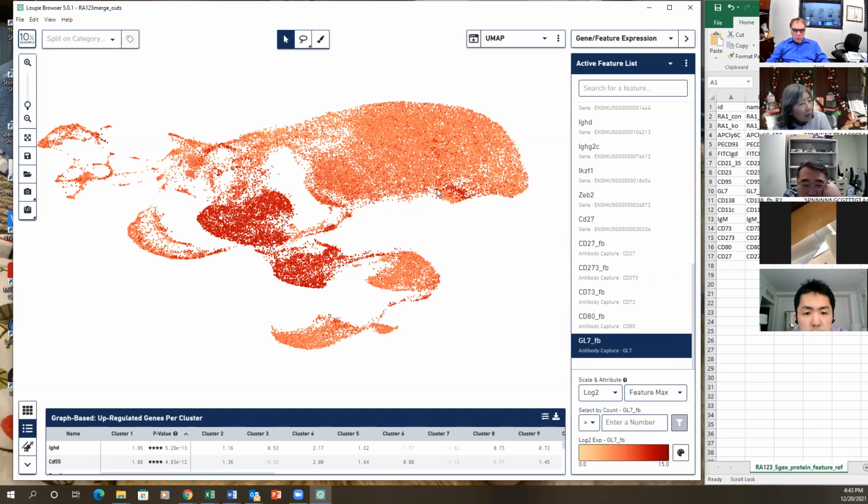So they're really not classical germinal center. It is not. So this area is funny. That is us, maybe. No, it's way too specific. I just don't think it's dead cell. But no dead cell, I don't see. Yeah, dead cells, I don't think you can.